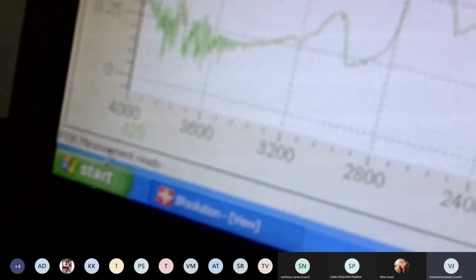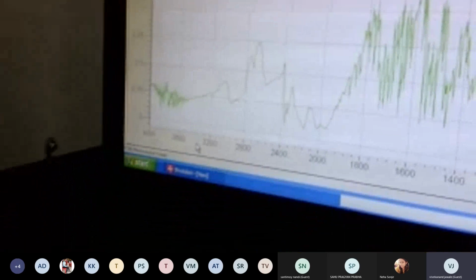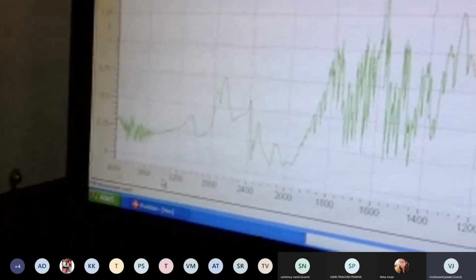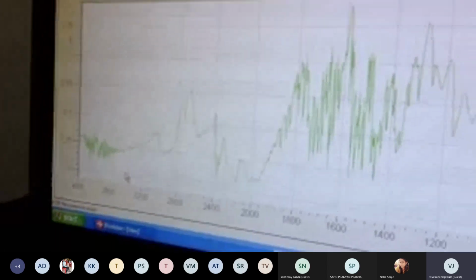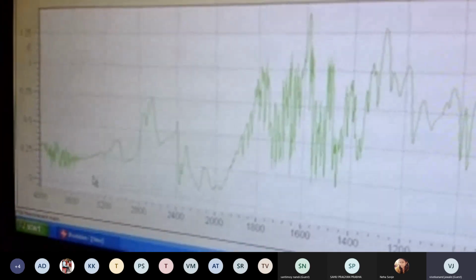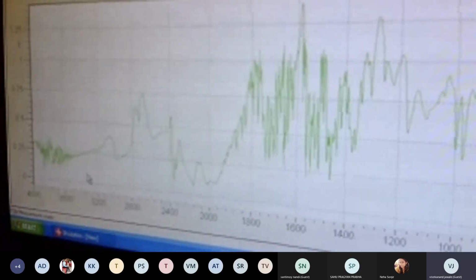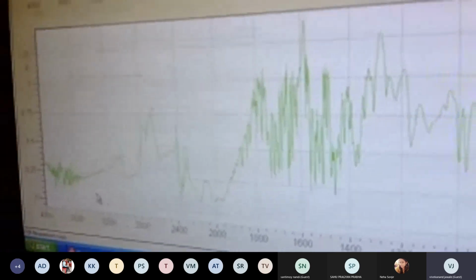Below that, at this corner you can see the number of scans, scan 29 of 30, and now the FTIR measurement is ready. What those scans are, I will tell you again in the next scan. But just see, this is the spectrum where you are eliminating this kind of peaks from whatever sample you are going to take in your measurements.